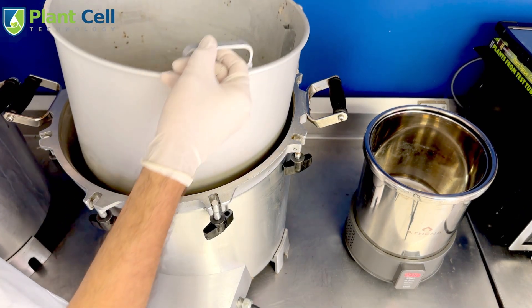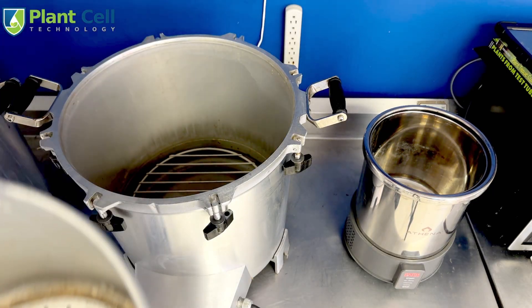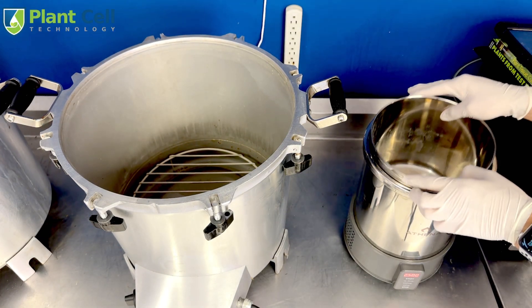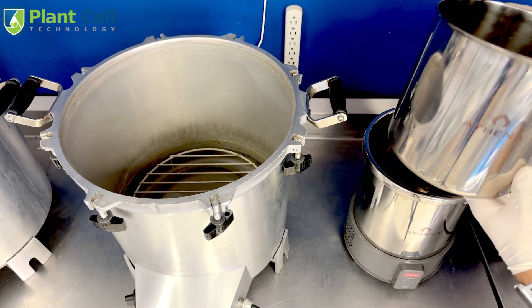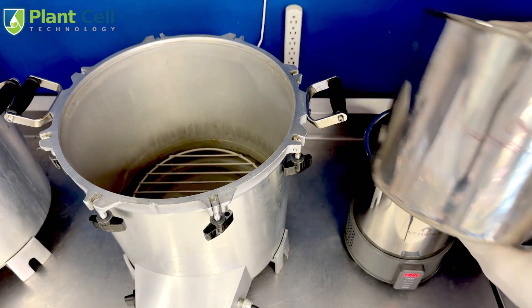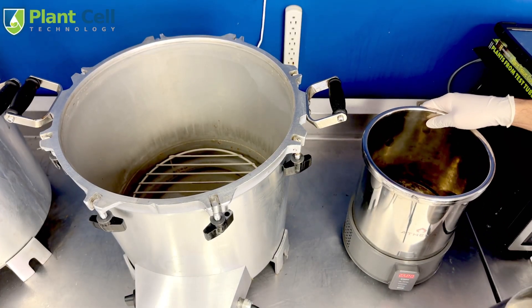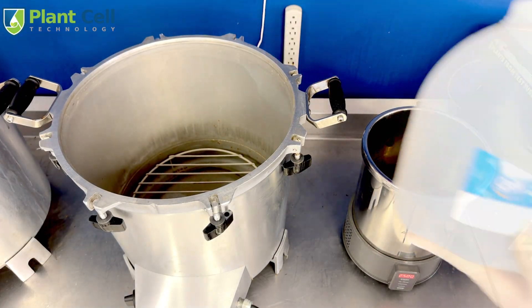The small one is made by Athena, it is 8 liters and it's also a very heavy-duty sterilizer. The size difference makes the Athena a much faster sterilizer — on average the Athena only takes under an hour to do a full cycle, and the All-American takes about two hours.